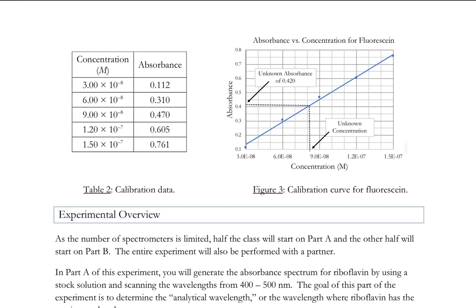So all of those mLs have 0.00 after them. Alrighty, so that will allow us to determine concentrations, and we will have absorbances.